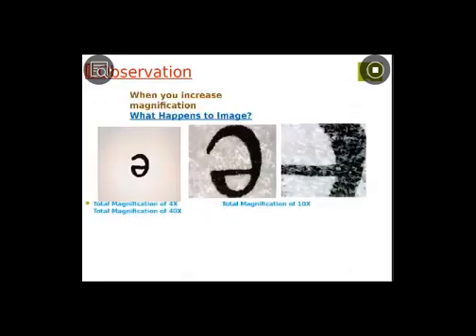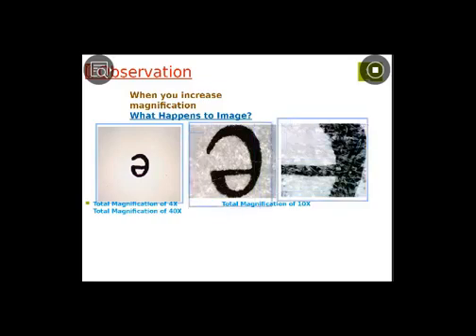This picture is shown to show the same thing I just told you. This is less power, more power, more power. So the difference is the field of view. When you increase magnification power, field of view decreases. So dear students, this completes my first experiment. If you have any question, you can ask me.